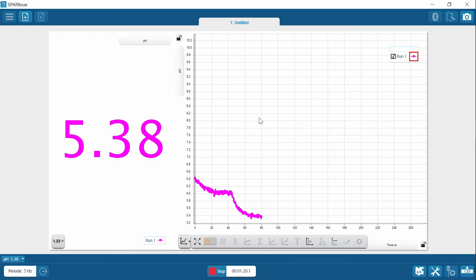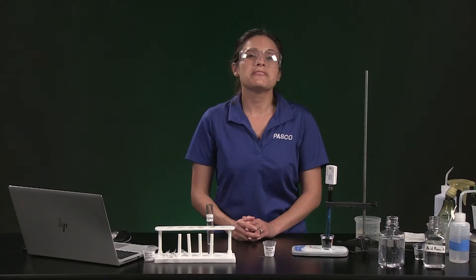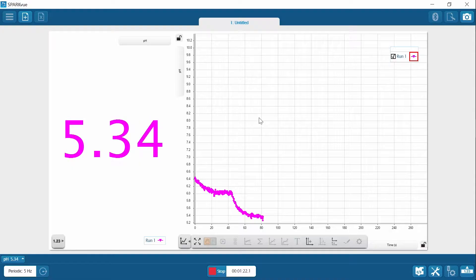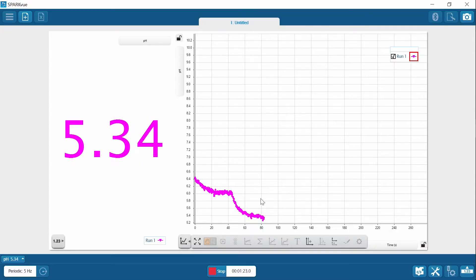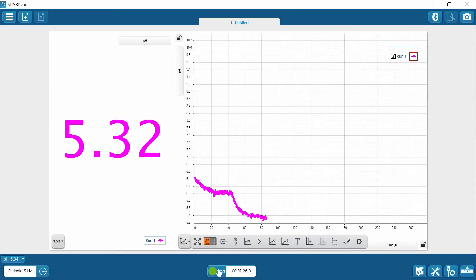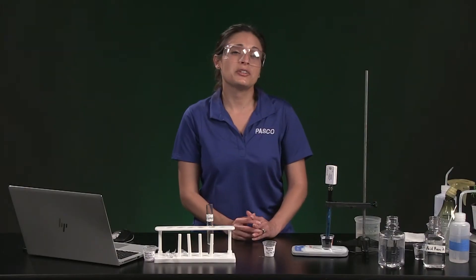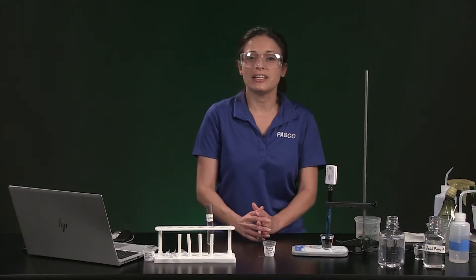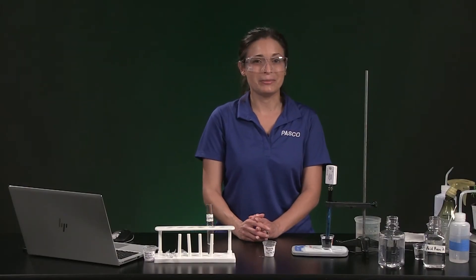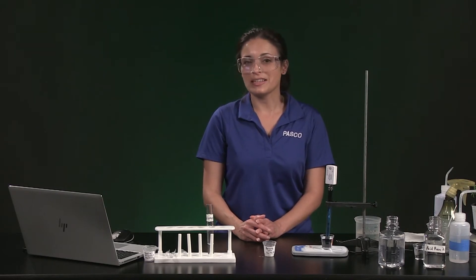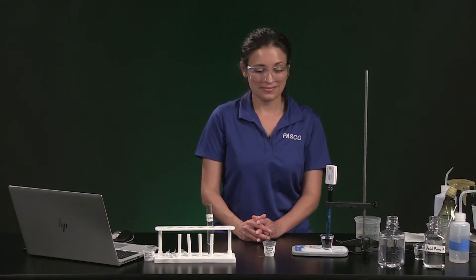Now that the pH has stabilized, record the final pH value in table 1. Pause the video so you can determine the change in pH and record it in table 1, then resume play when you are ready to continue.